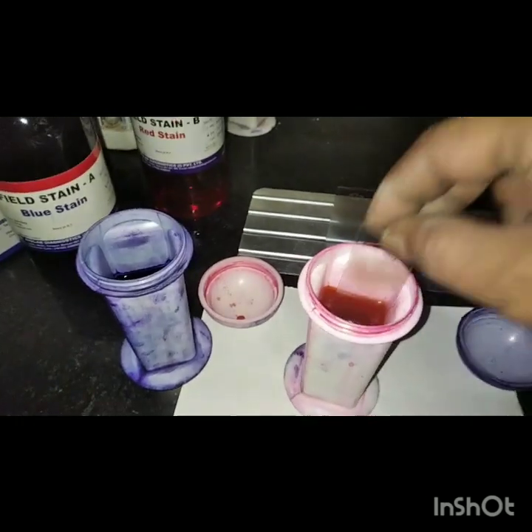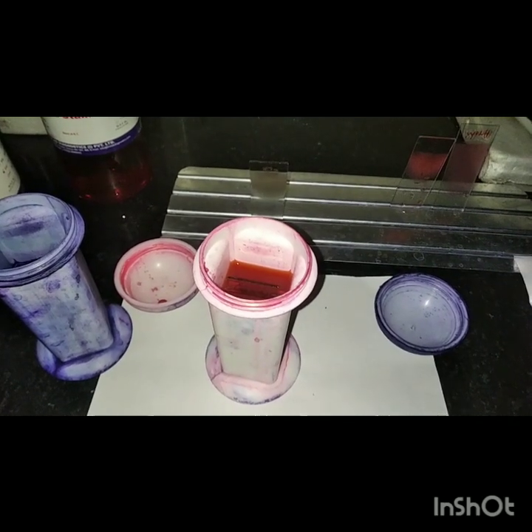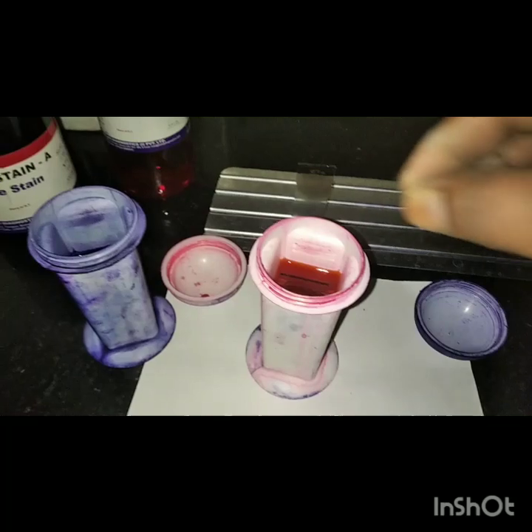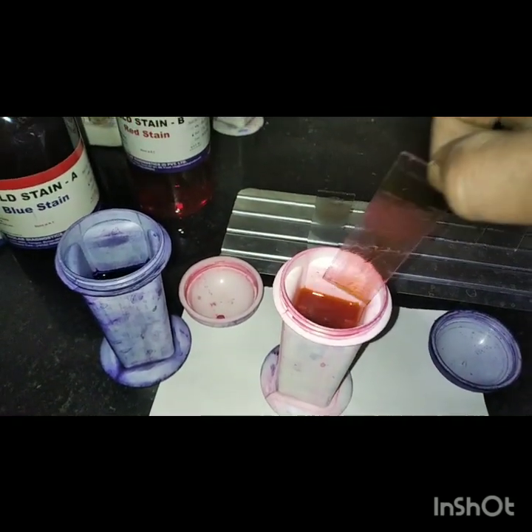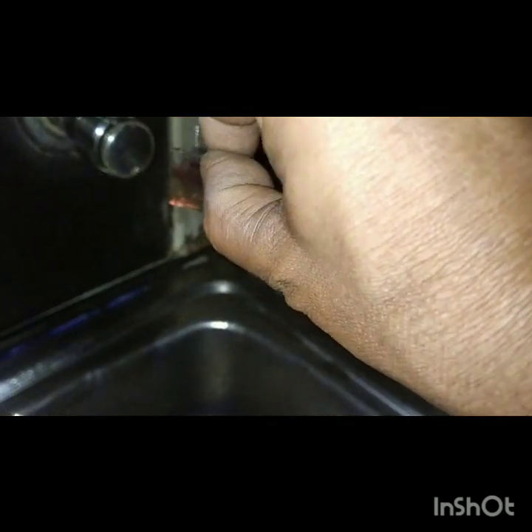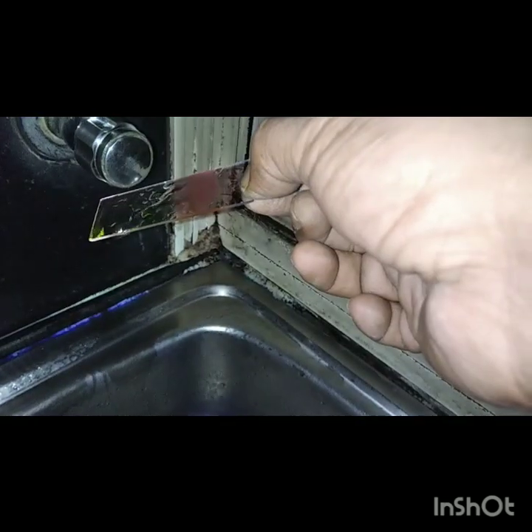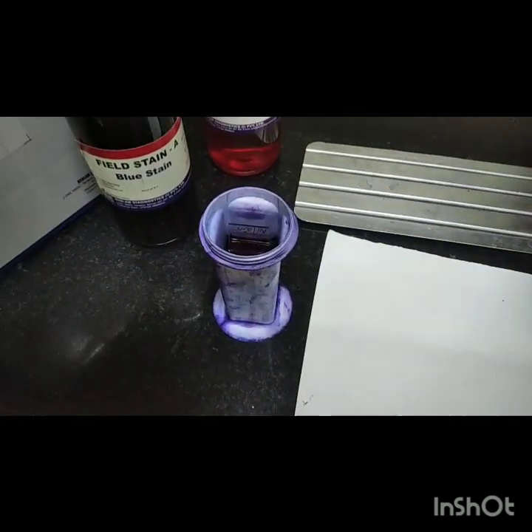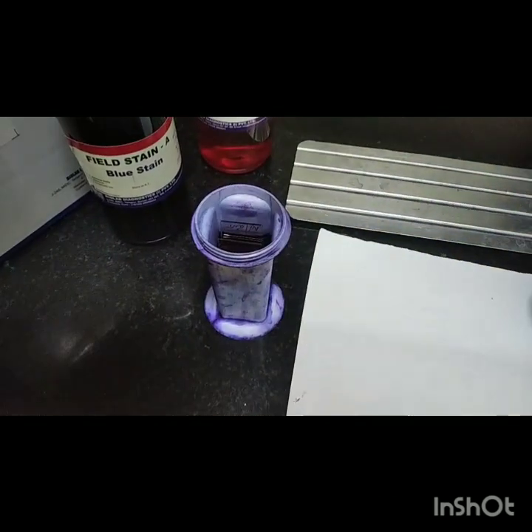After fixing the smear, put it into stain A for 30 seconds, then take it out and wash with tap water. After that, put into the B solution for 30 seconds, up to more than one minute.